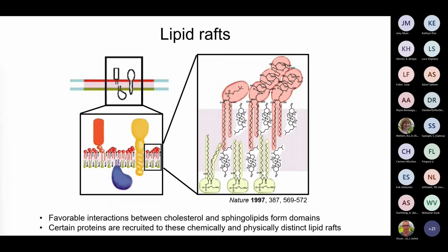These lipid rafts have been difficult to detect, though. If you try to label the cholesterol and sphingolipids and look at them with something like fluorescence microscopy, there were a range of conflicting results, and it was thought that the fluorophores were just as big as the lipids. Since non-covalent molecular interactions were responsible for function, those dyes were messing up the interactions and making it unreliable as a technique to look at.